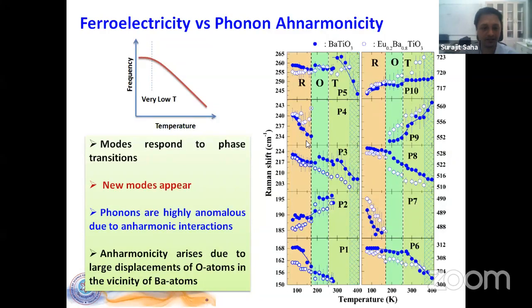And based on that, we see the phonons show response to phase transitions. For example, this is a phase transition. This is another phase transition. So here you can see a new phonon appearing, and then a phonon starts to show exactly opposite behavior. So new modes appear, and then the phonons start to show anomalous behavior.